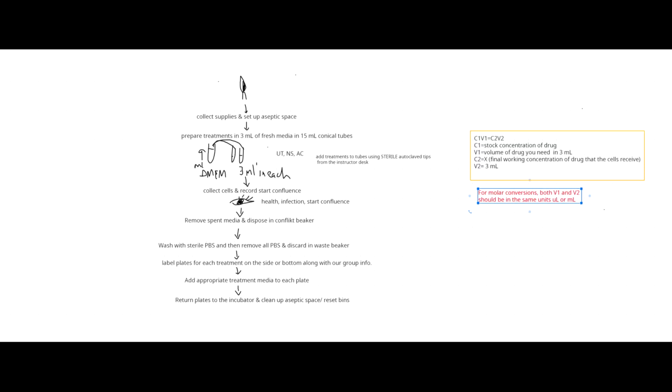So remember, guys, if you are using the column in 1 ml, you have to multiply by 3 before you get the actual amount of drug that you're going to be using in your 3 ml of total volume. So why not act smart and just use the one that's in 3 ml? It should be exactly the same once you do the conversion, right?